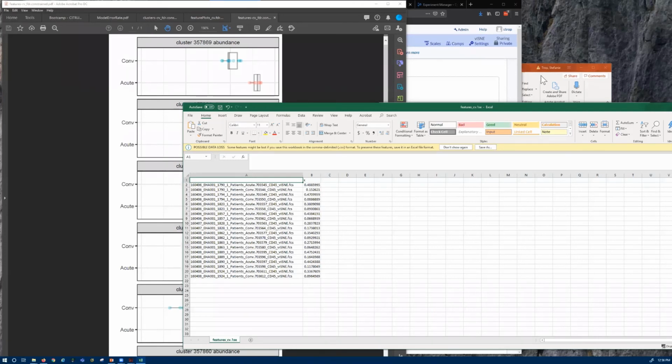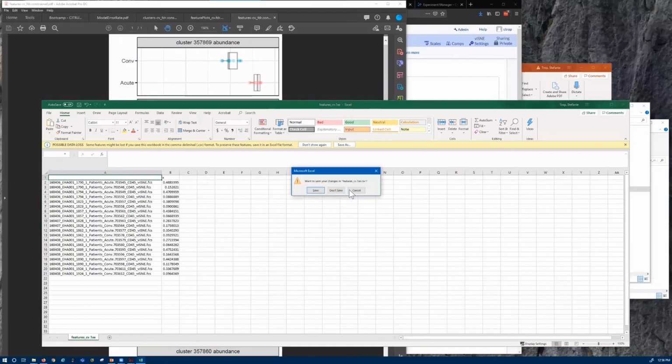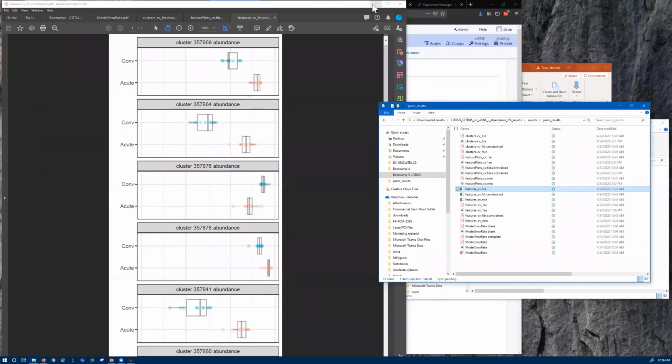Thank you, Steph. Okay, going along. Can you please explain the Citrus overlaid on Visney map again? And Steph, do you want to try that one again?